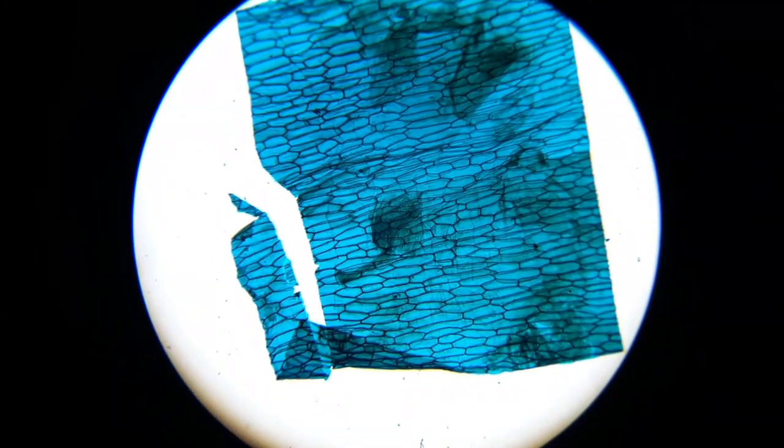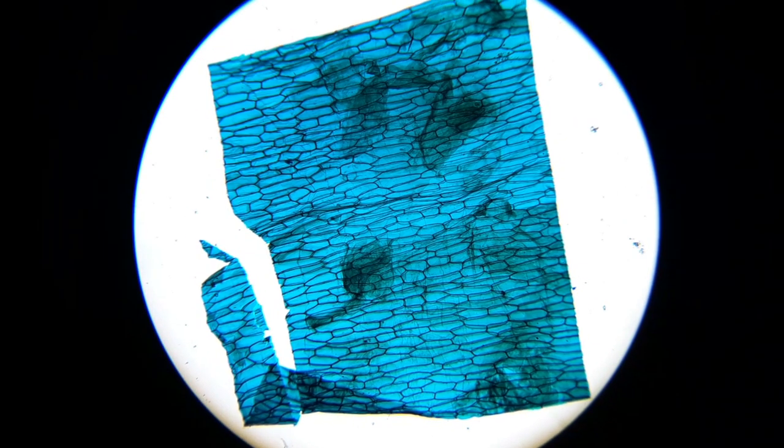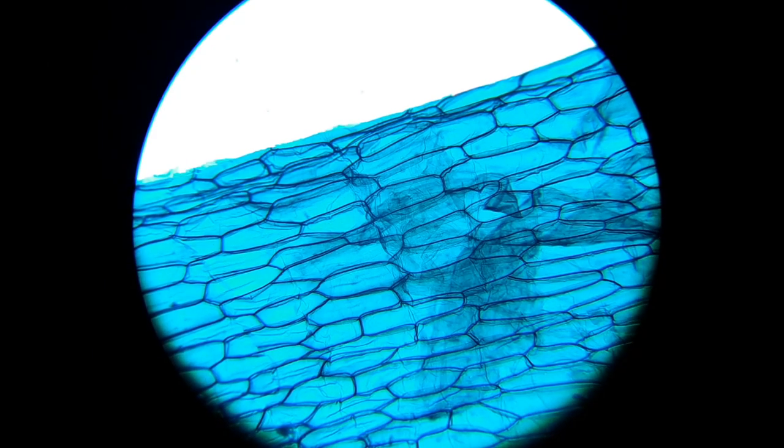And these are onion cells that have been supplied. So that's one of the five permanent slides, and I'm using here now the 4x. This is the 10x objective, and you can see that the picture is quite good. Okay, I'm now moving around the slide. I'm filming the whole thing with my mobile phone camera directly through the eyepiece, so you can see the individual cells. And this is now using the high magnification 40 times objective, and in this case I'm using the 10 times magnifying eyepiece. I'm focusing a little bit as well.